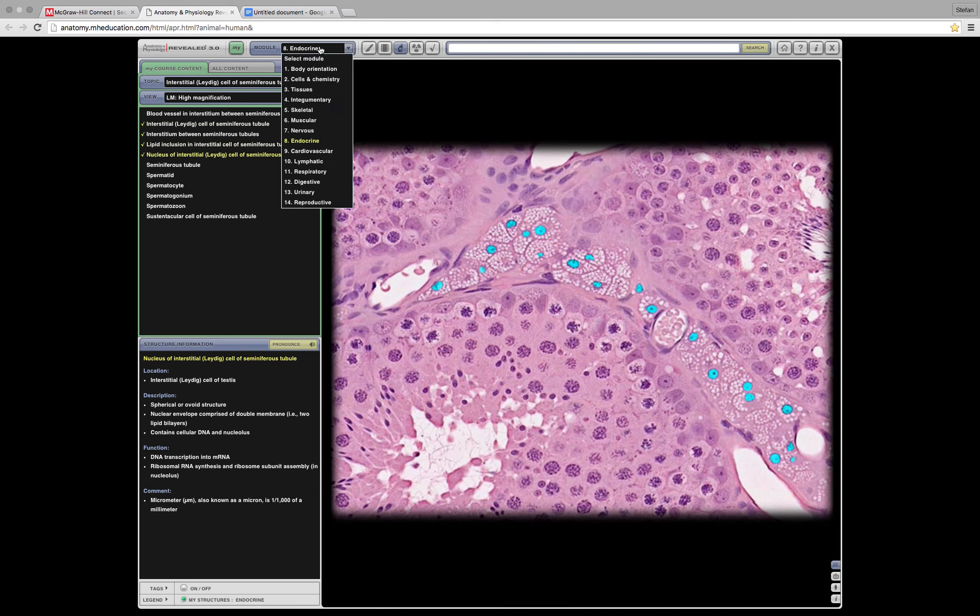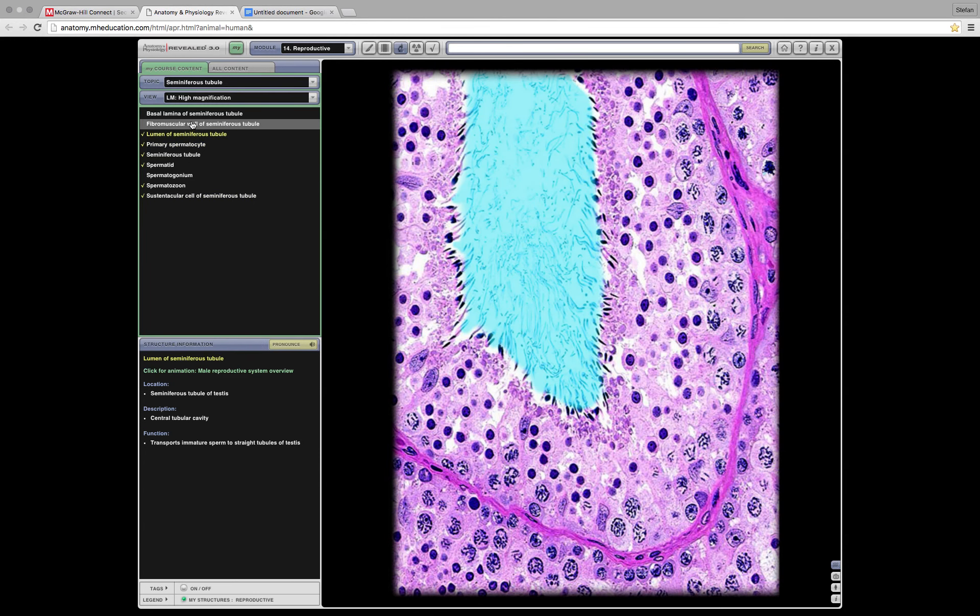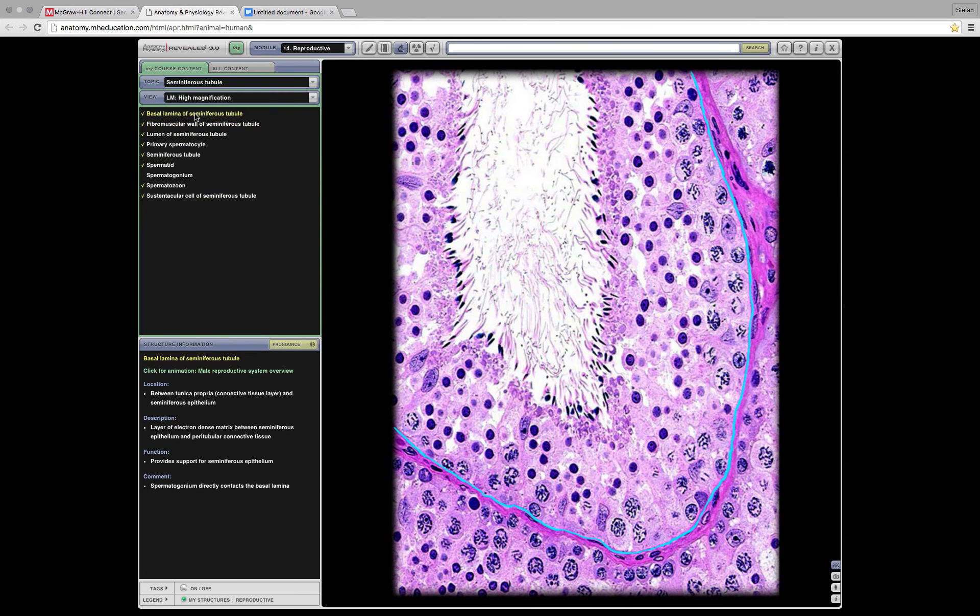Those are called the interstitial cells for obvious reasons. Where would they be even called? Spermatid? No. Spermatozoan? No. Yeah. The interstitial cells, which for some strange reason I can't highlight on here. They are the cells on the outside. Basically everything around this pink perimeter, those would be interstitial cells.